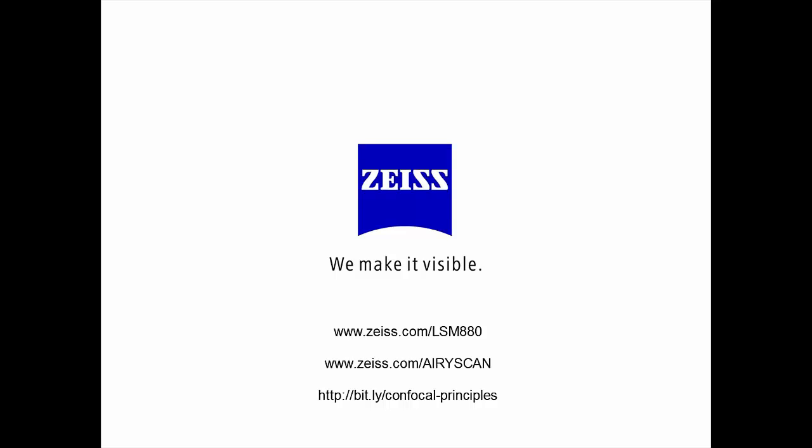The last question we have time for, I guess you've partially answered that there, and that is, can Airyscan be upgraded to previous Zeiss microscopes? Yes, we can add the Airyscan onto LSM 710s and 780s. There are some provisions, but for almost all of them it will work, and we just really need to do a component test. So if you talk to your local specialist, they'll be able to tell you what needs to be done. But if you've got a 710 or 780, the Airyscan is for you.